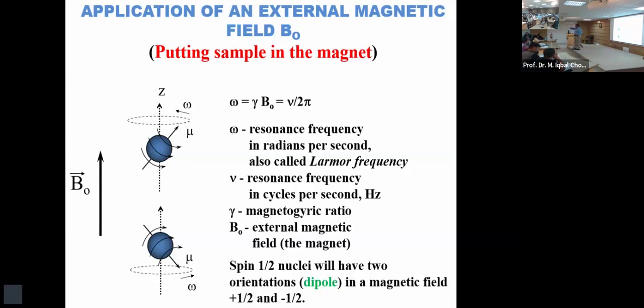And nuclear spins which are opposed to the magnetic field are higher in energy. So you don't need to worry that we have actually changed the direction of anything. We are just representing low energy being shown up and high energy being shown down.